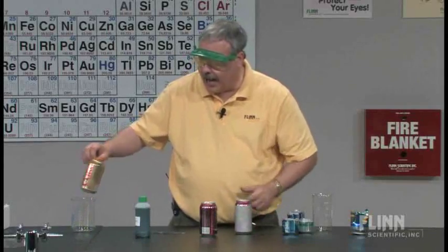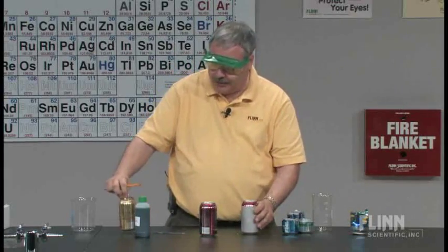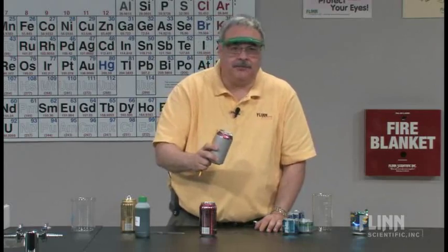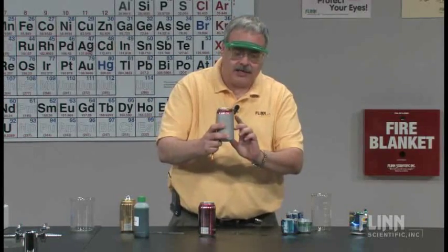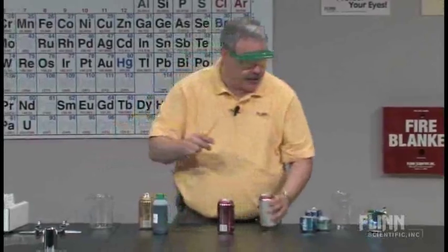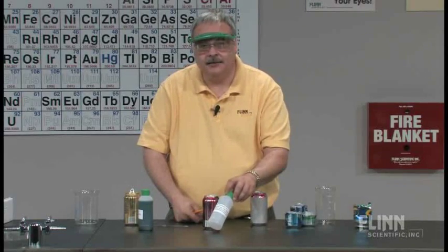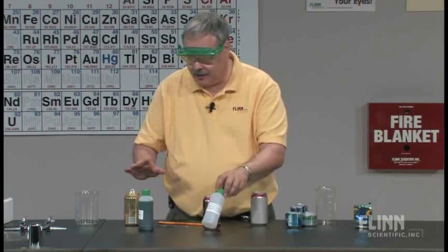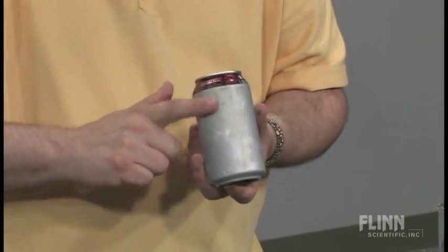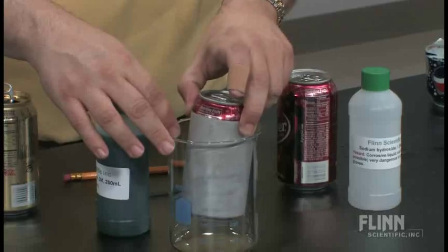Then what I would do is take a pencil and insert it, open the can, and get rid of about two-thirds of the pop — you're going to have to play with this amount — so you have enough for ballast and weight. Then you just stick the pencil in there, put it in a beaker, and you will add 1.5-molar sodium hydroxide. I would recommend doing this in the hood, just to be on the cautious side. You've got most of the soda out, and now you've got the can in a beaker where you're going to pour the 1.5-molar sodium hydroxide around it.